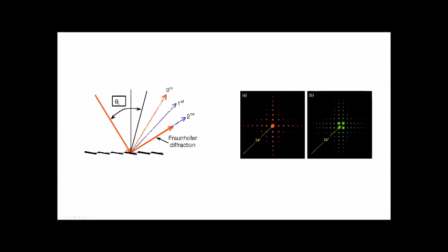reinforces the diffraction pattern along a specific direction, which is basically the direction that the mirrors point. That is called blazing the diffraction grating, and it is only blazed for certain wavelengths. So if you take a particular wavelength of laser light, you might get a very bright spot along one of these diffraction orders. In our case, it's the 3-3 order, the 3rd order on the X and the 3rd order on the Y direction. But if you take a different color, you're not blazed at all.